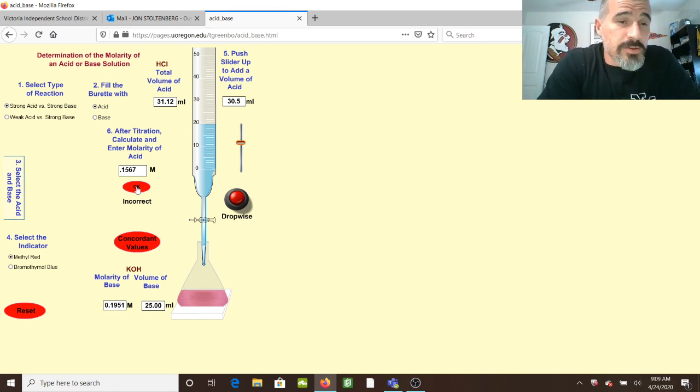This is trial 1. It's okay to be incorrect. Unless you're super patient, you're probably going to go past that neutralization point the first time, and maybe even the second time. We're going to do 3 trials here. So each trial, hopefully you're going to get a little bit closer. So trial 1 is done.